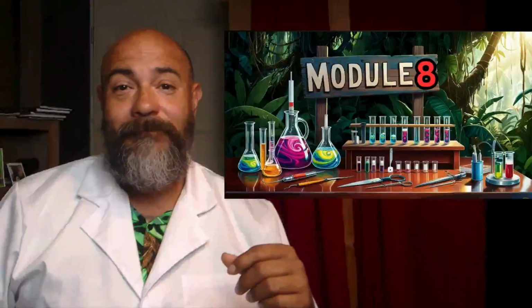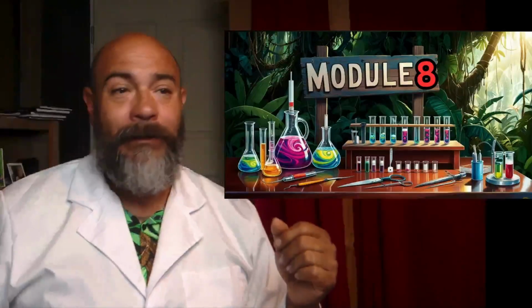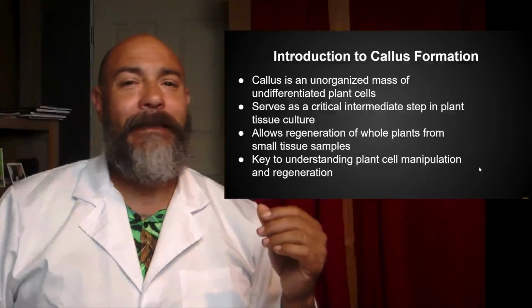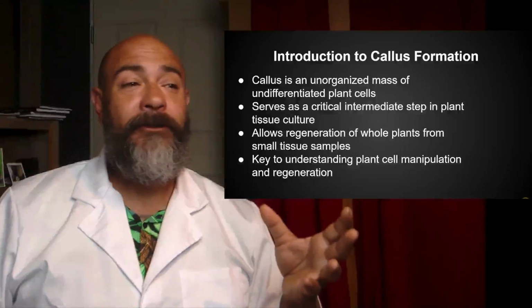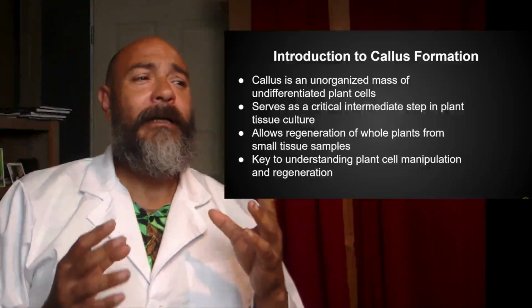Welcome to today's module. This is module number 8, how to induce callus formation. So, what exactly is callus formation? What does that mean? Callus is the mass of undifferentiated cell tissue that doesn't know whether or not it is roots or shoots.